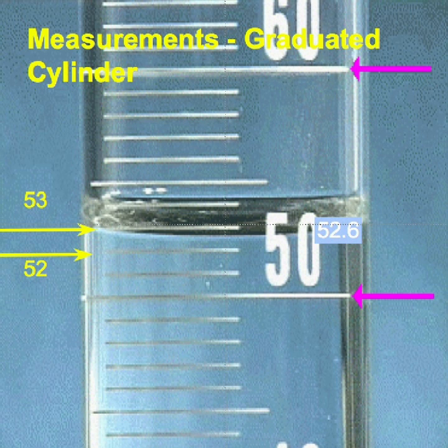In this example, we have a graduated cylinder. A graduated cylinder is a tool that is used to measure accurately the volume of a liquid. When we measure a liquid's volume, we must measure the bottom of the curved meniscus. In this case, our meniscus falls somewhere between 52 and 53 milliliters. So we read the scale to the nearest tenth of a milliliter. In this case, I came up with 52.6 milliliters.